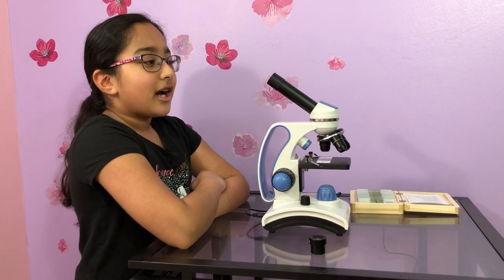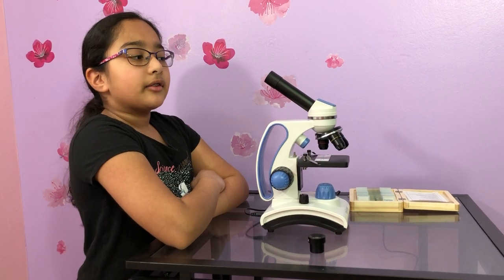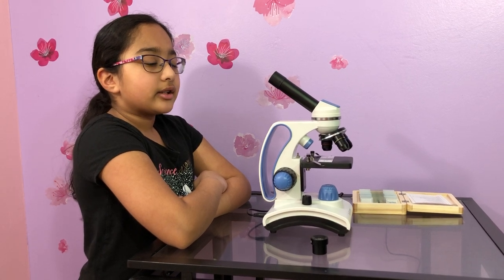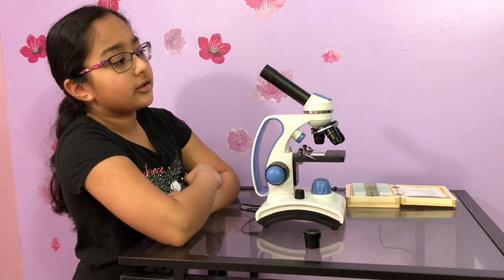Hello everyone, my name is Sachi and today I'll be telling you about the different parts of a microscope. Right now I have an Amscope 162c and I'll be telling you all the parts.